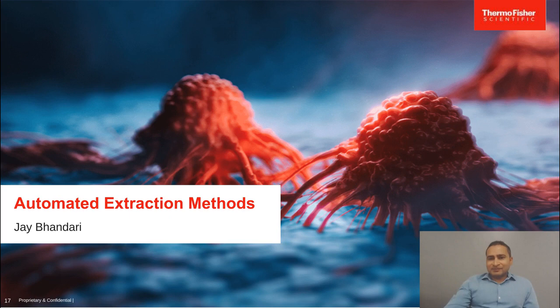Thank you, Anupriya. That was a really good intro to our gold standard methods for RNA isolation using spheroids and organoids. Again, my name is Jay Bhandari. I'm one of the application scientists here at Thermo Fisher Scientific. In the next few slides, I'll introduce some of the automated and high-throughput extraction methods for these 3D cultures and present some experimental data for RNA isolation for spheroids and organoids using these methods.